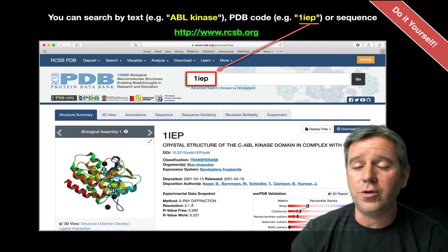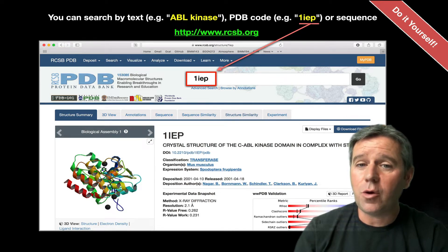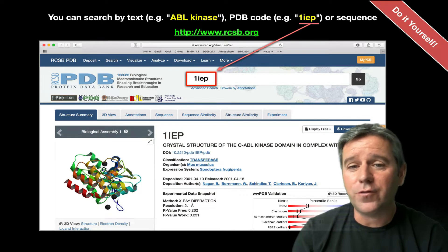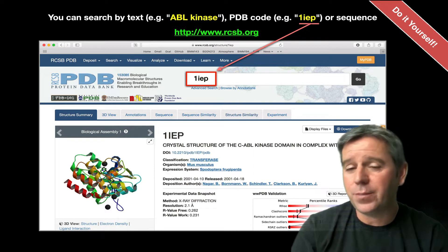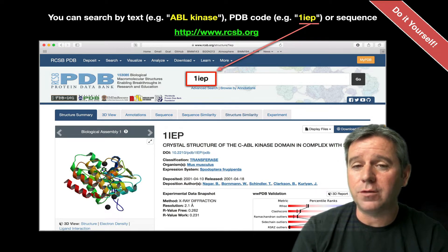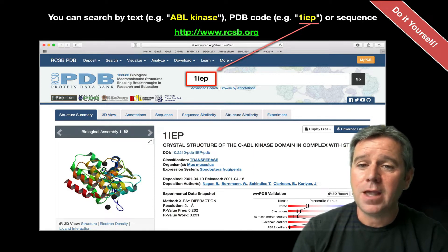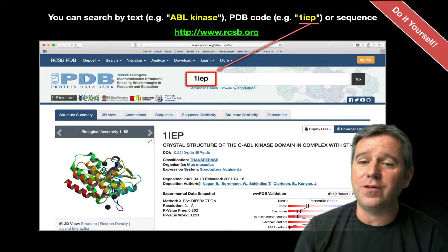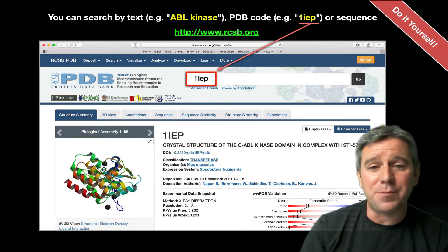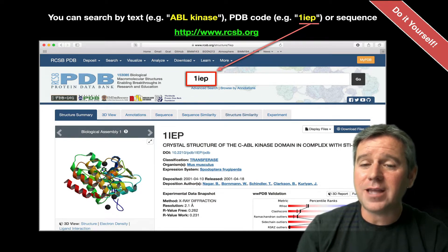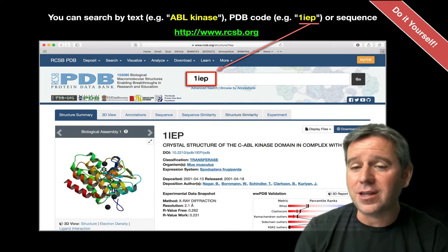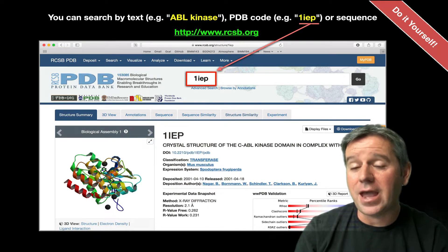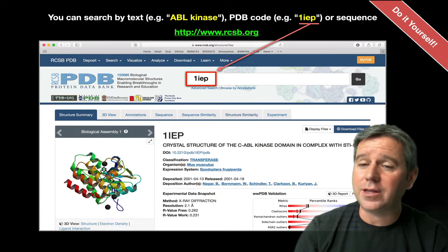What we're going to use here is a PDB accession code — one of the database identifiers for the PDB itself. All PDB codes or accession numbers have a similar format: they're four characters long, the first is always a digit, followed by typically three characters. In this case I'm searching for the code 1IEP, and when you do that it pulls up a structure summary telling you details about the experiment — in this case x-ray crystallography — the journal citation, sequence, and an overview of the structural quality of this entry.